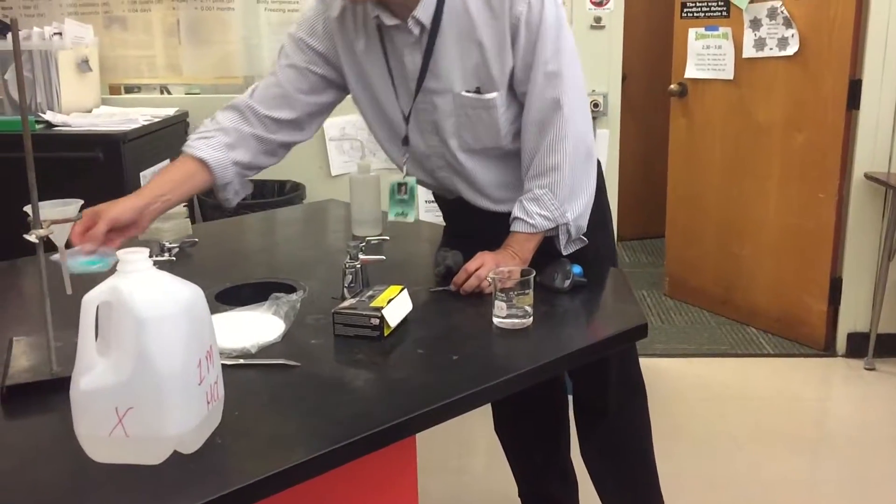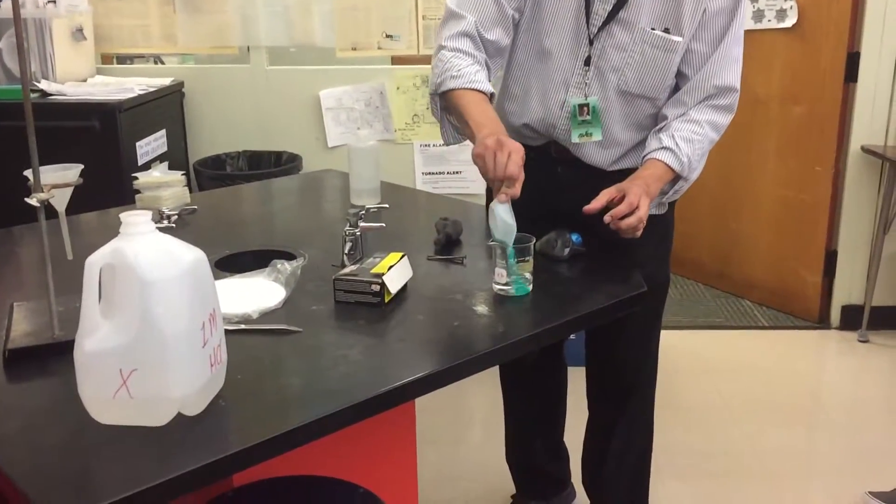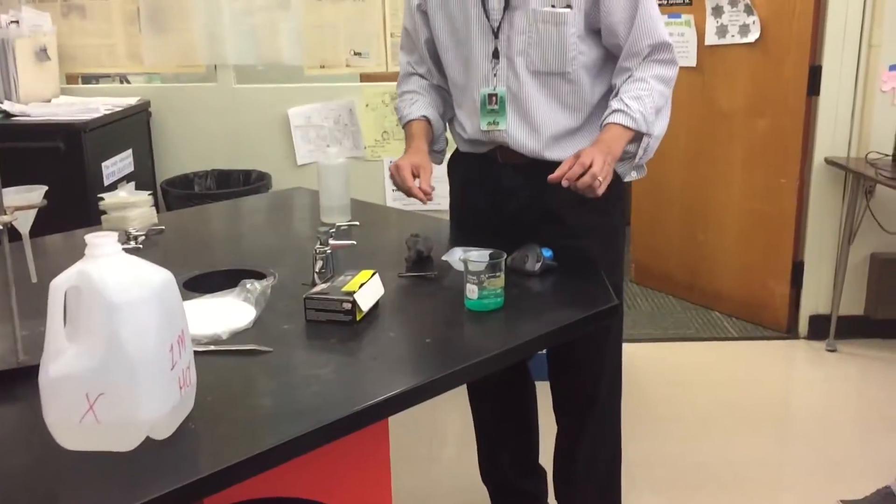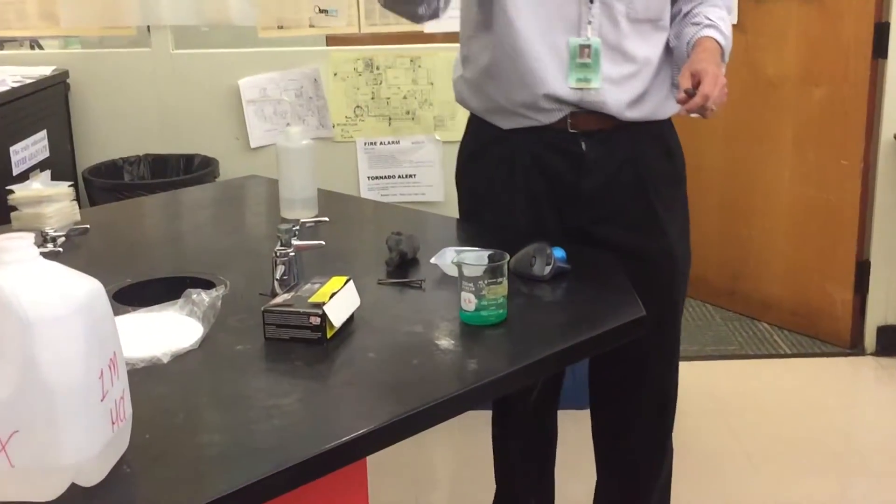We'll take our about 8.5 grams of copper chloride, put it in there, and we want to dissolve it, and there's a couple ways we can do that.